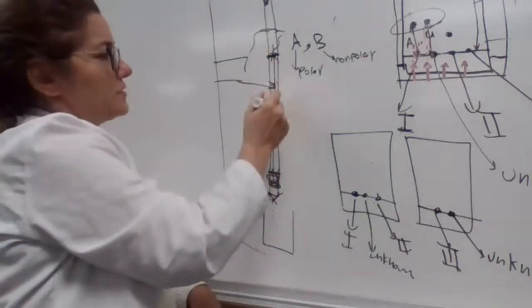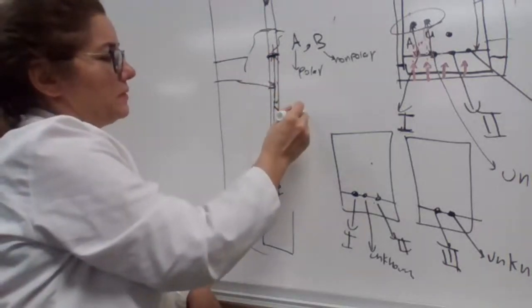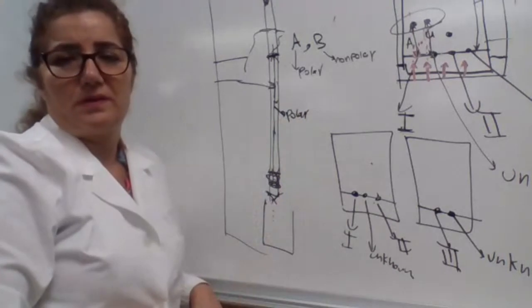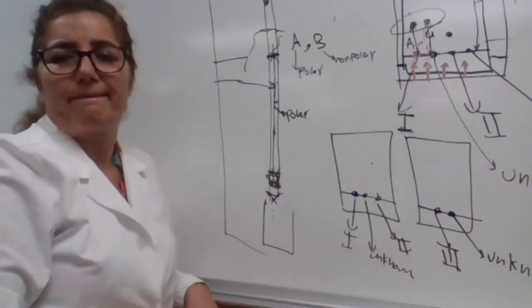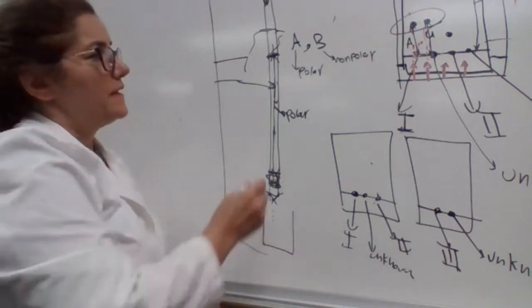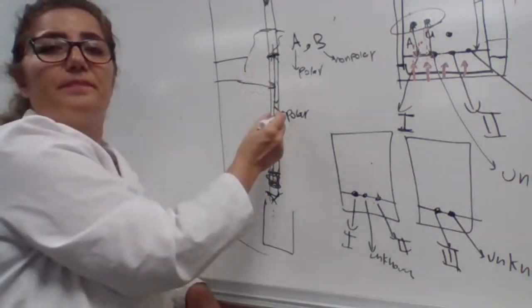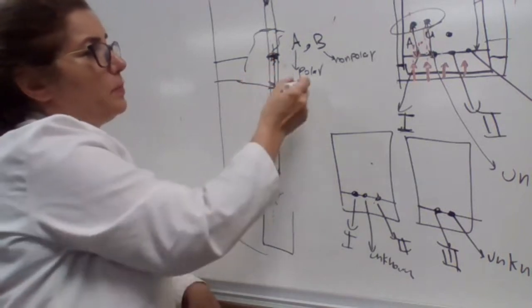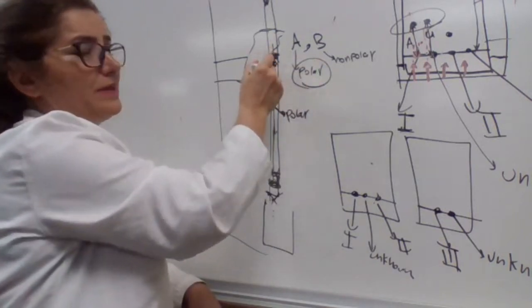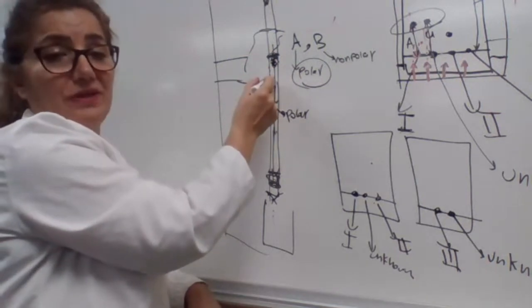Your stationary phase is going to be polar. If the stationary phase is polar, polar wants to interact with the polar stationary phase.